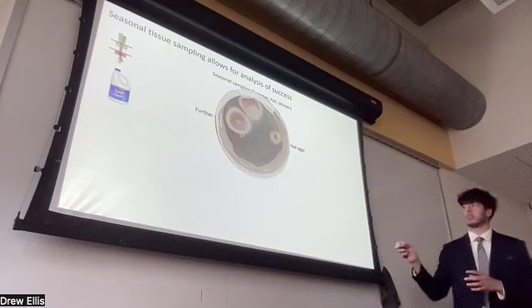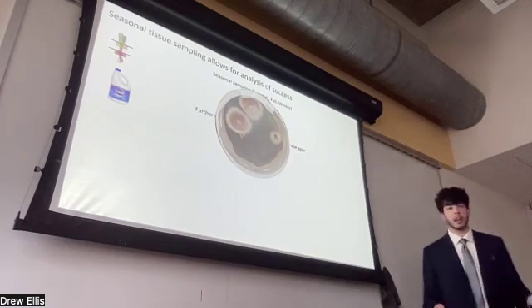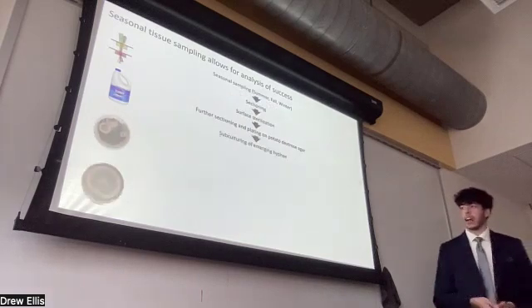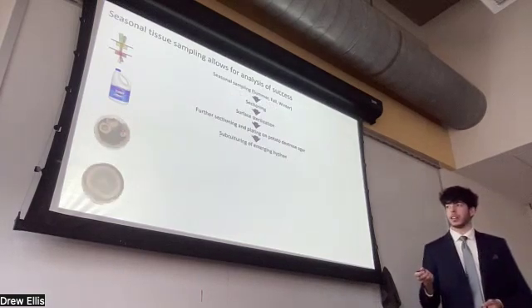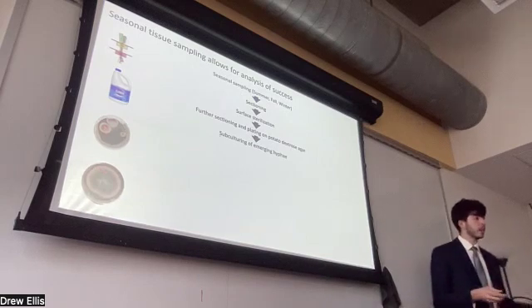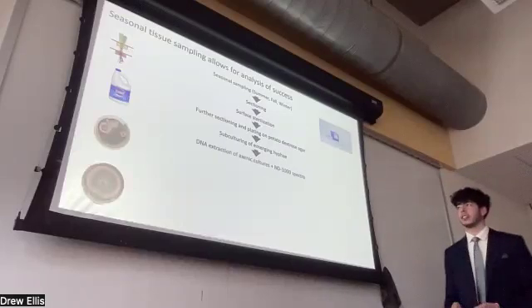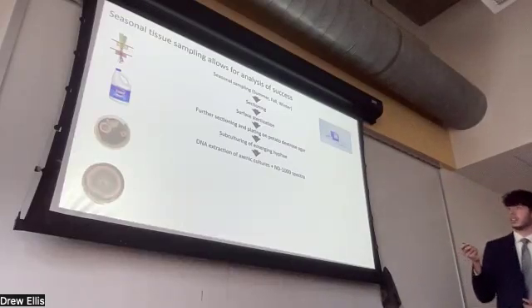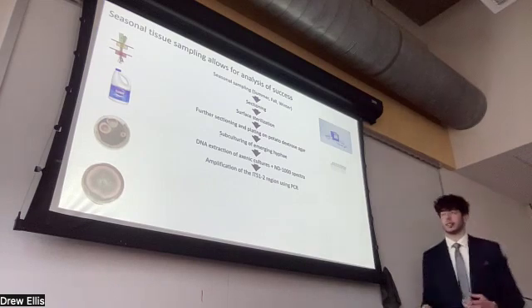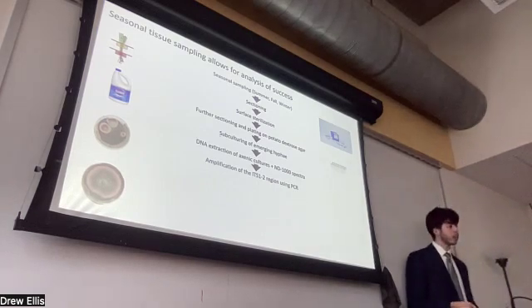We placed them on potato dextrose agar plates, which is a widely accepted way of culturing these fungi. And once we saw the hyphal emergences of those little fruity hyphal mycelial bodies, I then was able to plate them on a separate plate to get them by themselves, in an axenic culture. And once I achieved an axenic culture, I took the DNA from those fungi. I performed amplification of the ITS 1 to 2 region using polymerase chain reaction.